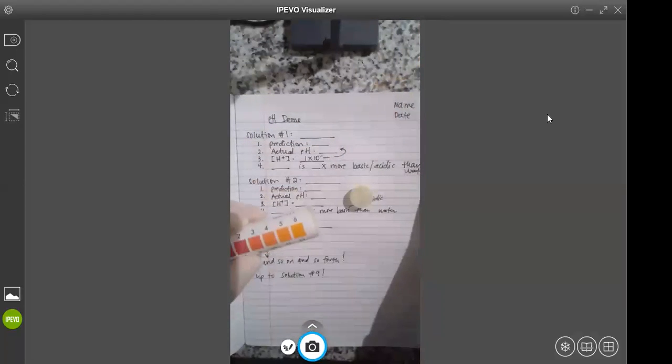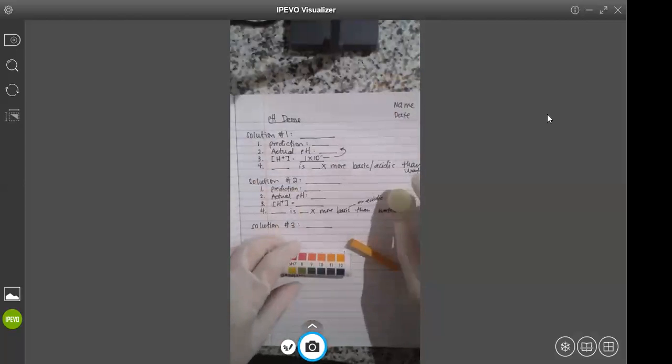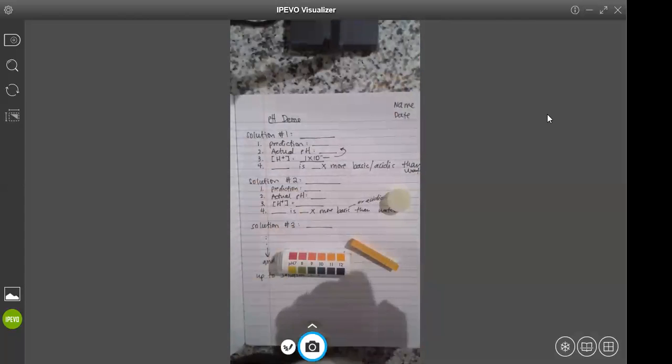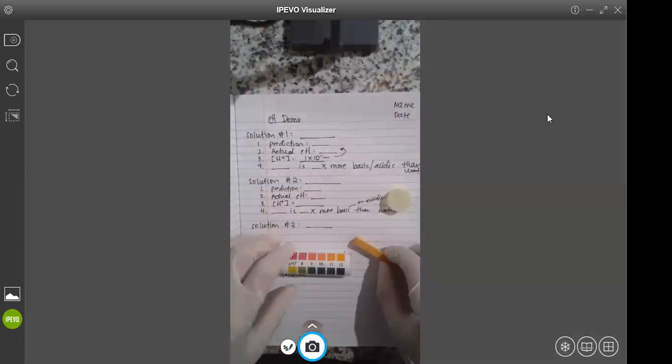So I'm going to put the extras over here. Again, we have different solutions. I want you to pause and write down the name of the solution after each one that we go through, and then go on with your prediction, and then watch the demo for the actual pH.